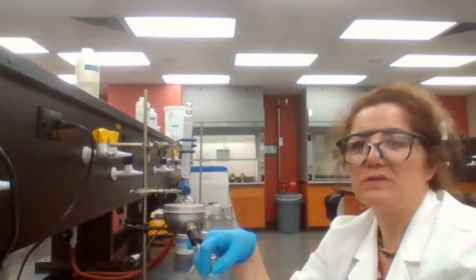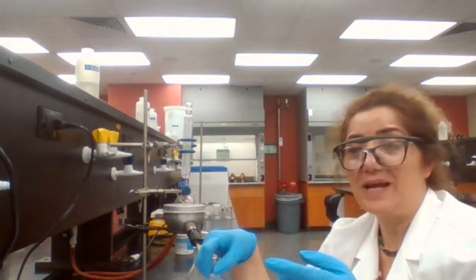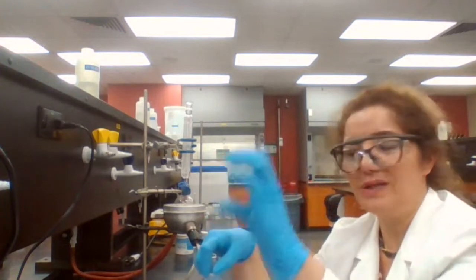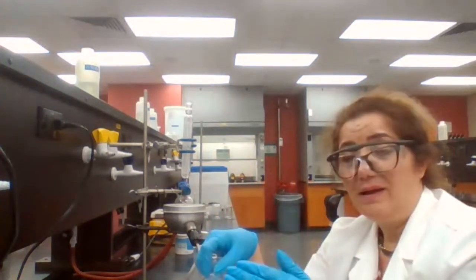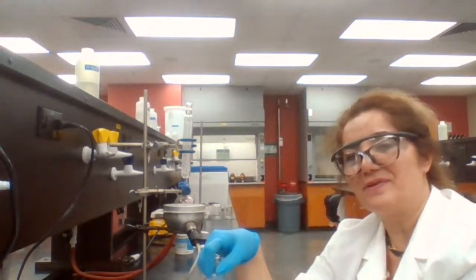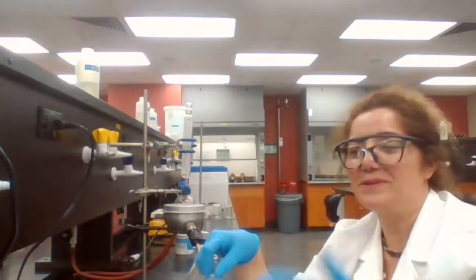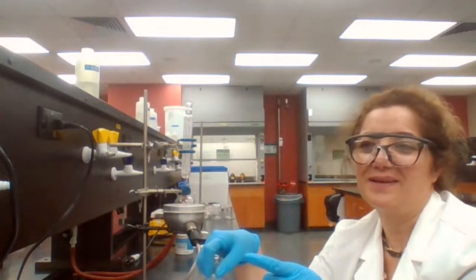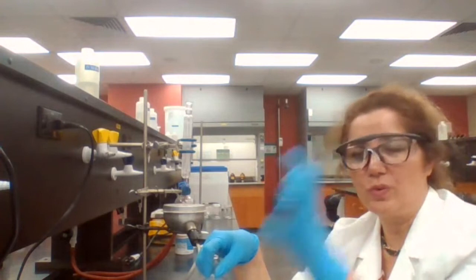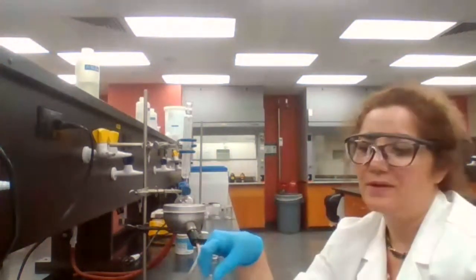So your solvent sounds good. You can separate 90% each time you do extraction. So with the first extraction, you get 90% out in the organic layer. You separate, you leave it in a container. Then the second time when you do extraction, you get 90% of the 10% that is left. That is like 9%. And if you repeat for the third time, you get 90% of the 1% that is left. So it's going to make a better separation. But if you do just one extraction, you only get 90%. So you lose 10% with one extraction.